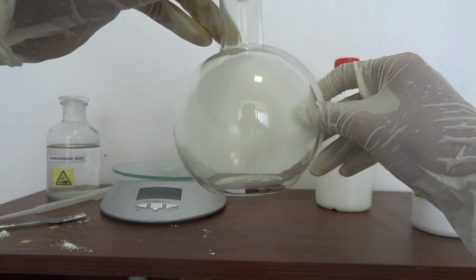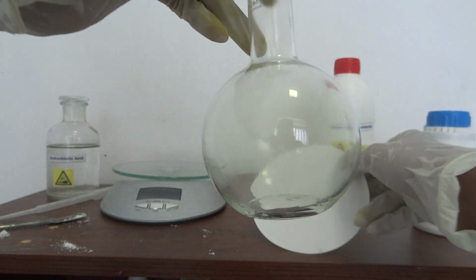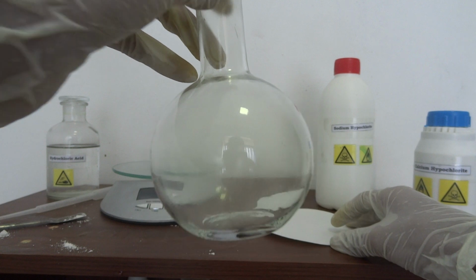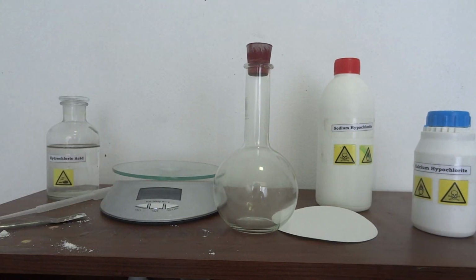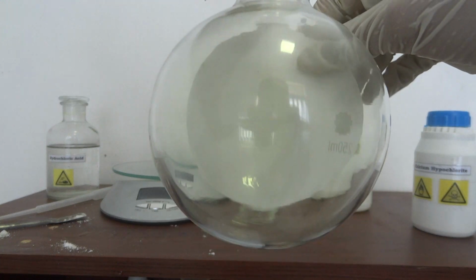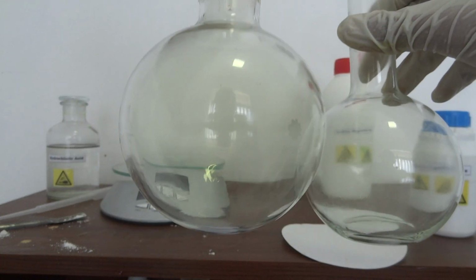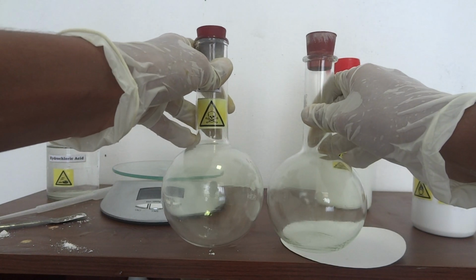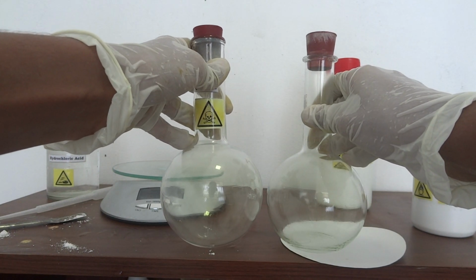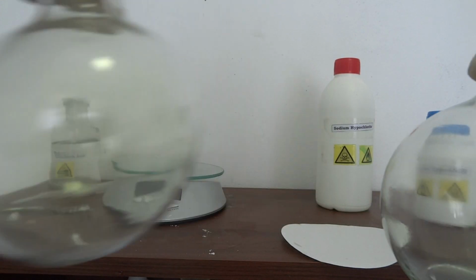If you can see here, that is a pale yellow gas. This is another round glass which has chlorine. This one has more chlorine. So yeah, chlorine is poisonous, and it also has a very strong smell.